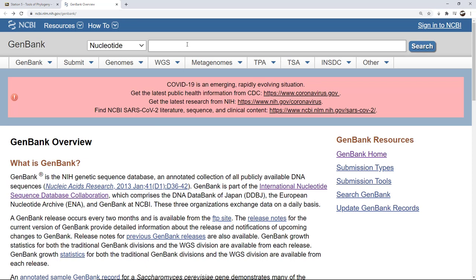So with that being said, we're going to now search for cytochrome C oxidase subunit 1. Up here in the search bar I'm just going to type that. But I also told you that you need to know the organisms you are looking for. In this case we're going to start with Canis latrans — extra credit if you remember what this is — this is the coyote. And we're just going to look for this.